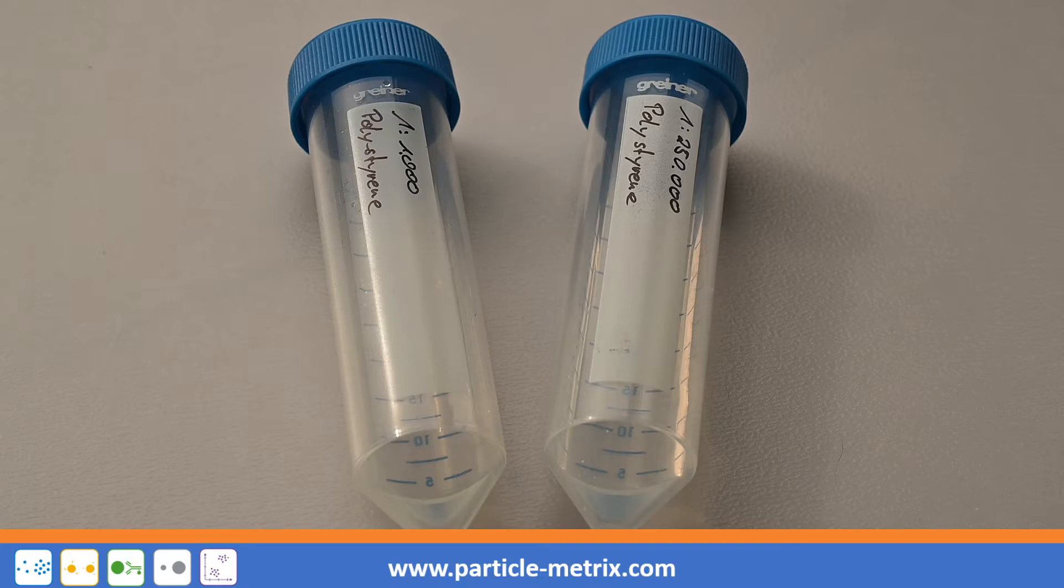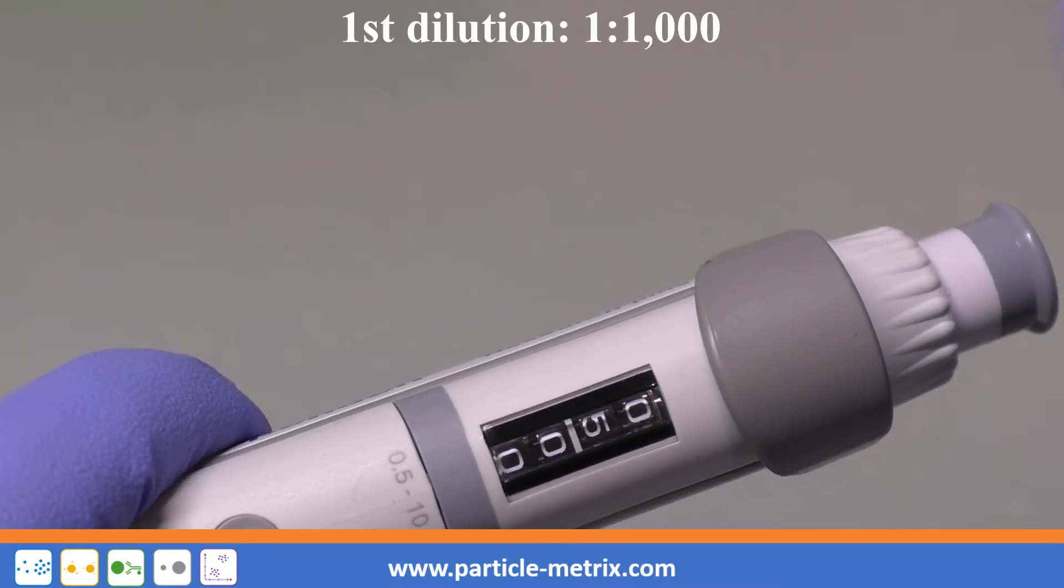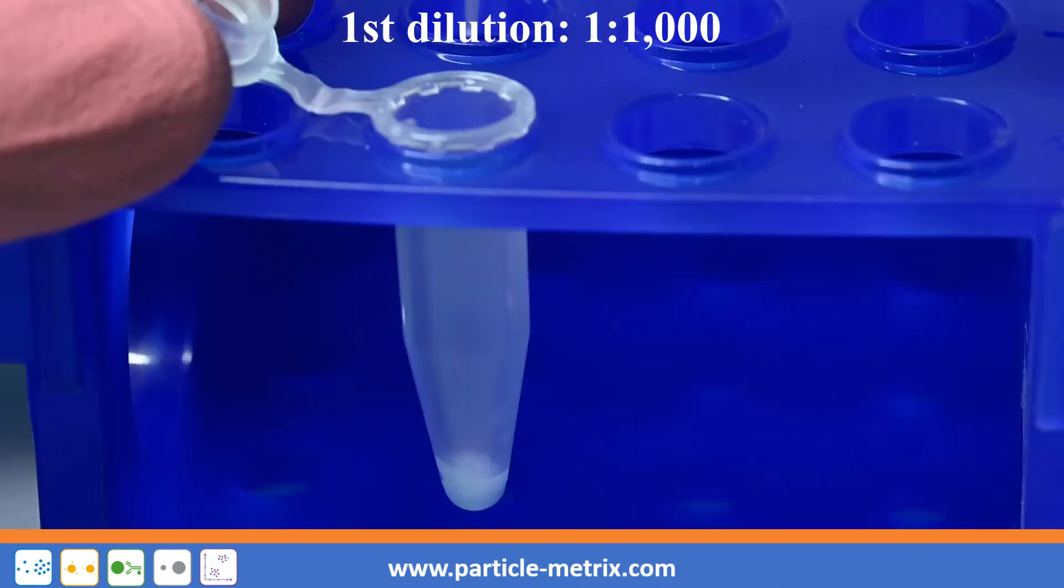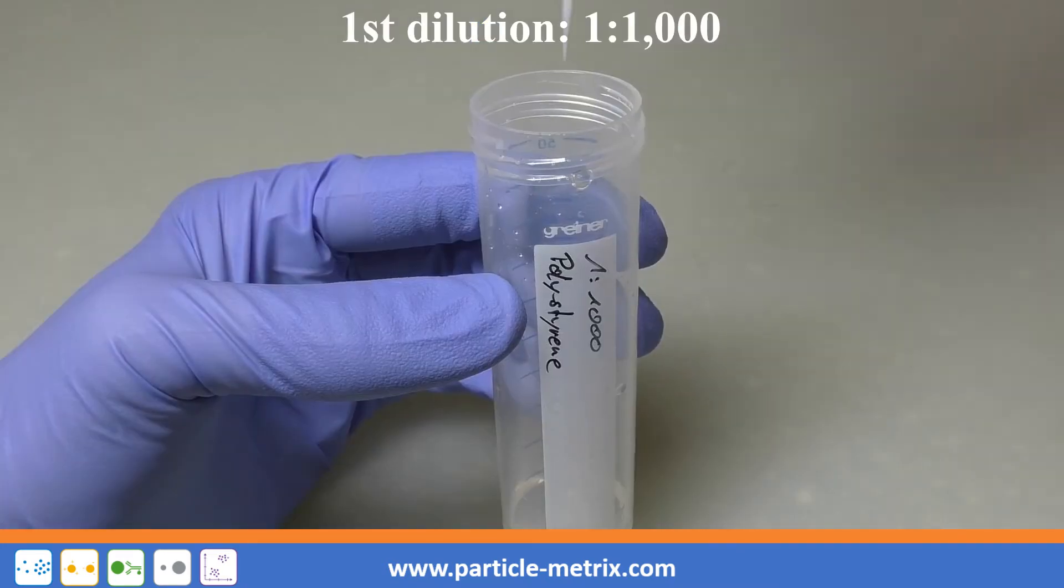The preparation of the alignment suspension requires two separate dilution steps. In the first step, take out 5 µL of the original solution and pipette it into 5 ml of particle-free water.